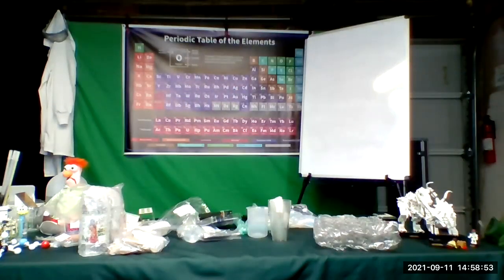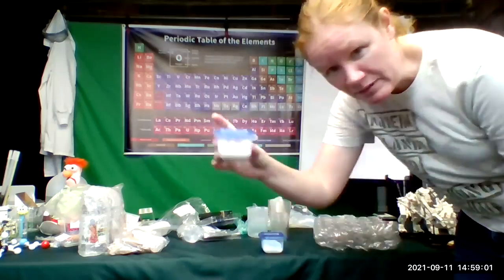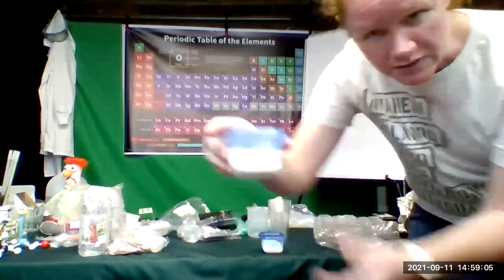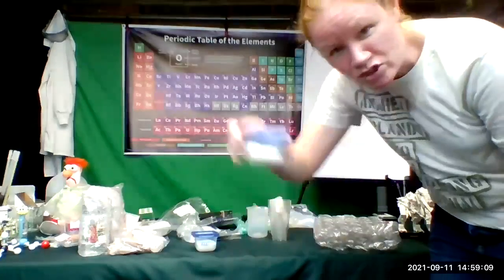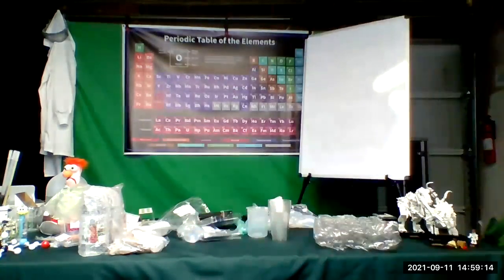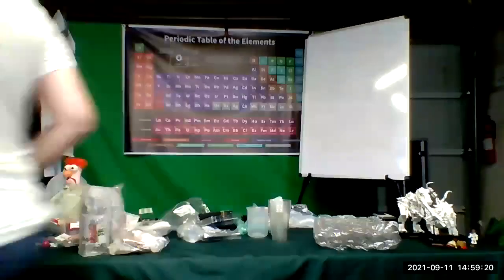And then there will occasionally be times when the experiments call for other supplies around your house. Like a common one is table salt. So I have a little container of table salt that I have labeled. You can see I have NaCl written on it. And then sometimes sugar. So I have a little container here that I've written sugar on. So I don't always have to go into my kitchen and raid the stuff in my kitchen. But each experimental protocol will tell you what you need.